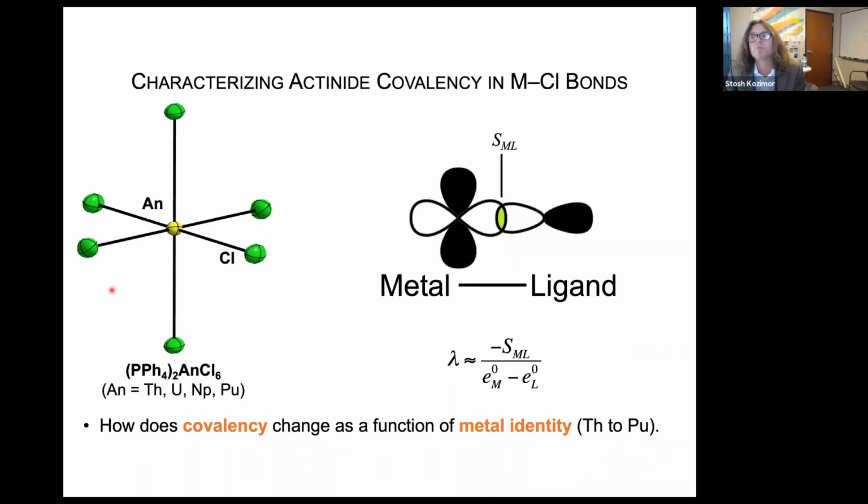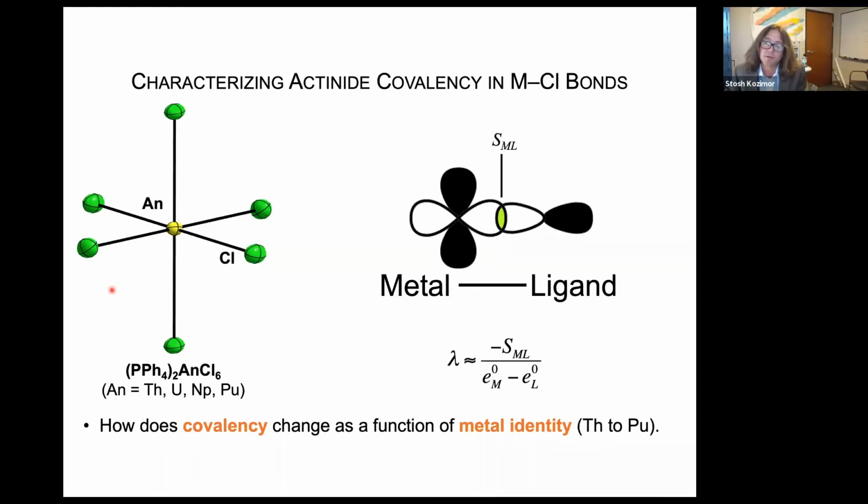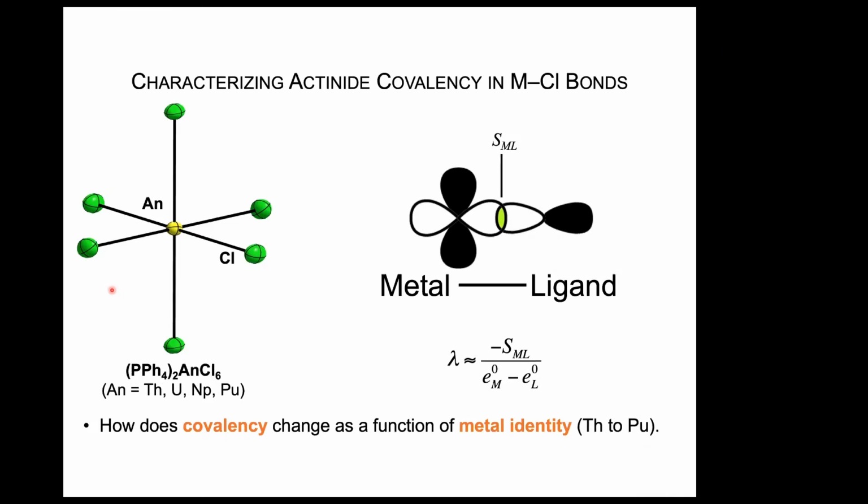And then the other thing you bring up is that the containment strategy for these radioactive samples is a mess. So we've got a 4-micron window on the sample, Mylar or polypropylene, and then that's in our own special chamber, and that's under helium, and that's isolated from the beam with a beryllium window. So there's 1, 2, 3 layers of containment for each one of these samples, but it has to be transparent at 2800. Yeah. It's a drag.